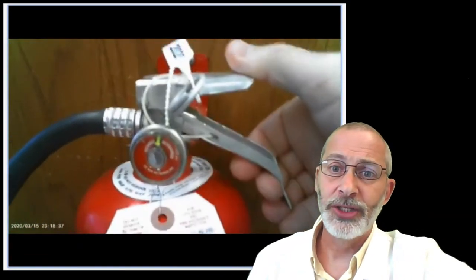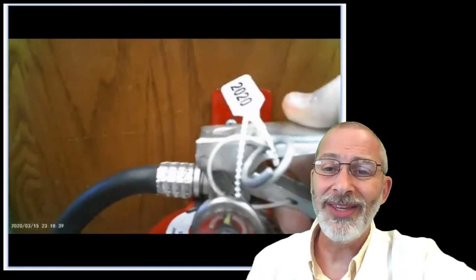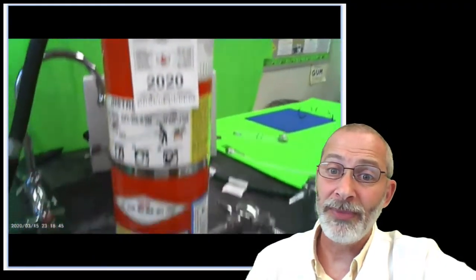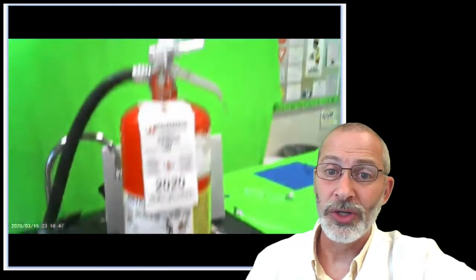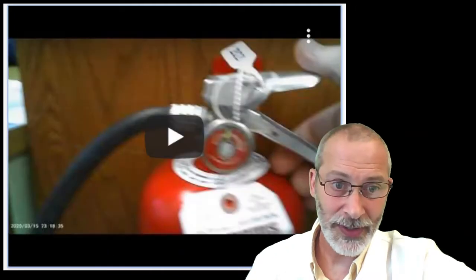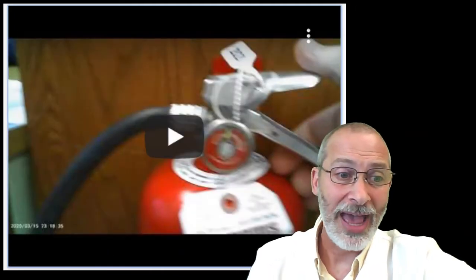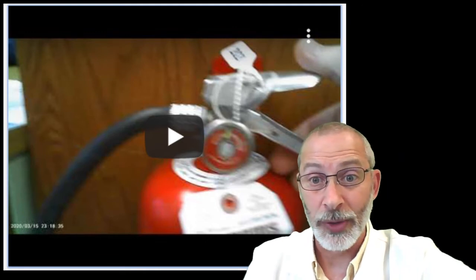That is the part that you would hold on to spray, and you would have to squeeze the handle after removing that safety pin. And that would be done after lifting up the fire extinguisher, and you can see how big it is. So that is the fire extinguisher, and hopefully we will never have to use the fire extinguisher.